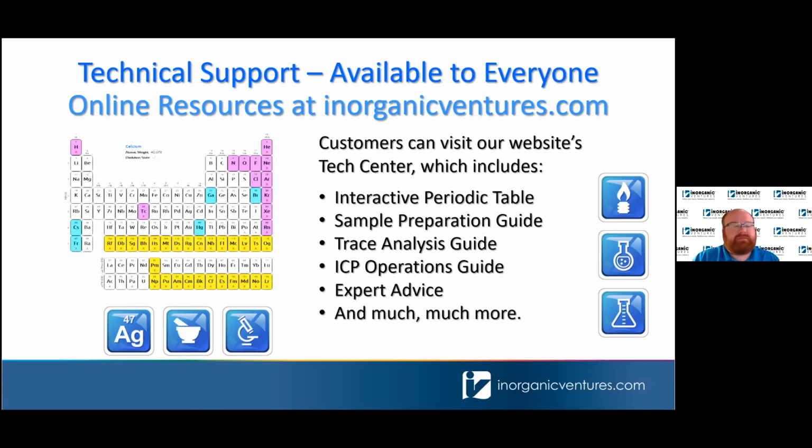Okay, great. Moving on to RBS 25, have you heard of any issues using RBS 25 with Miramist nebulizers or a nebulizer specific issue with RBS 25? Not. I have not heard of any issues. I know that's the recommendation Glass Expansion has for most of their nebulizers. I'm not sure which one the Miramist is. I think that might be the smaller one.